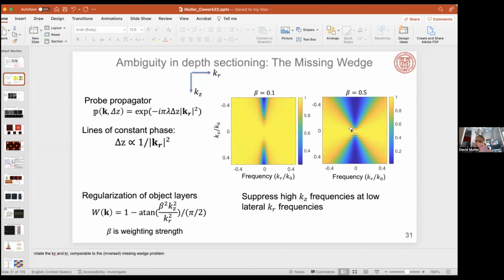But because I've got, rather than a line, a propeller blade, I can actually go to about maybe 10 degree step size. And that translates to maybe I need about 15 or 20 slices rather than about 80 or 100. So it speeds up your tomography collection by about a factor of 10.